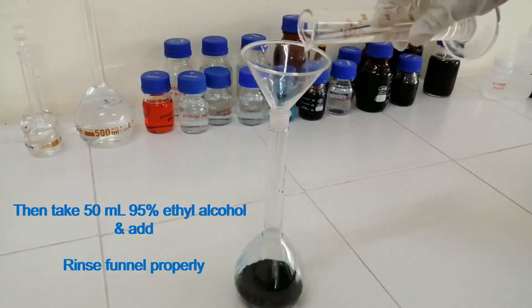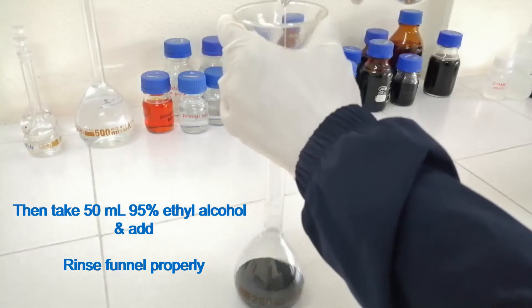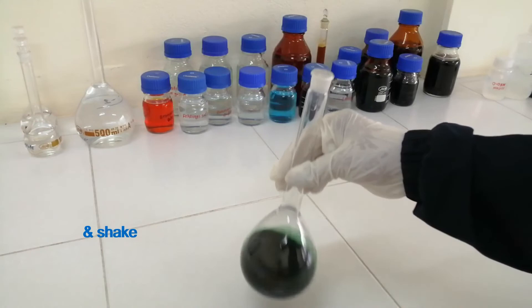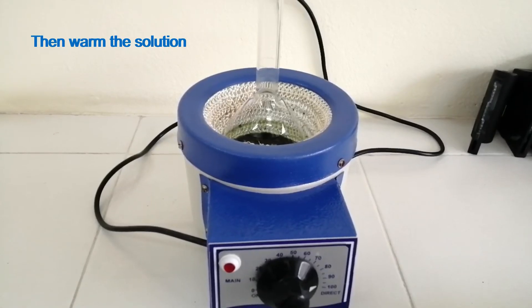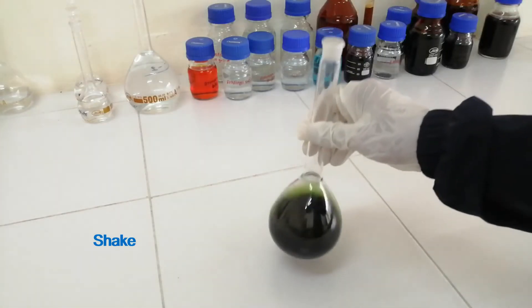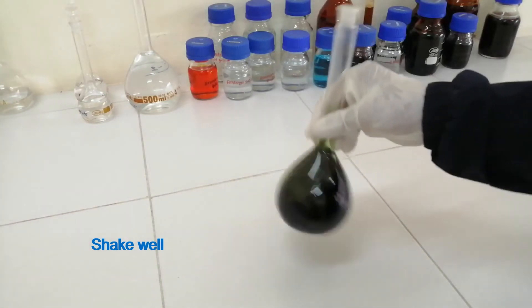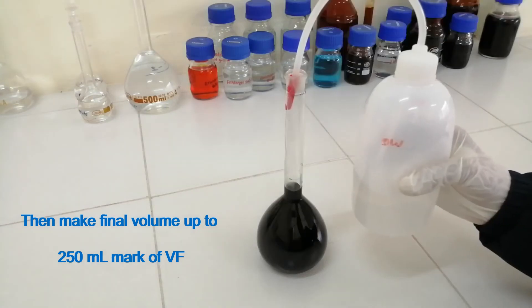Rinse well properly and shake. Then warm the solution and shake. Add distilled water, shake well, then make the final volume up to the 250 ml mark of the volumetric flask.